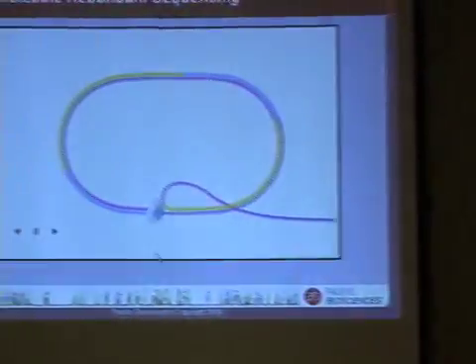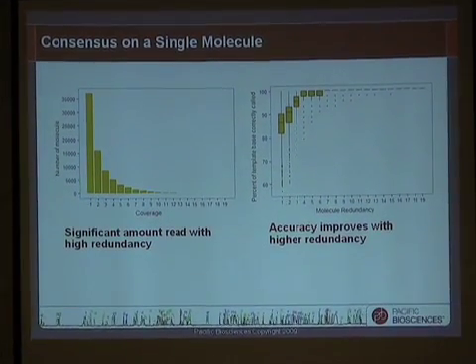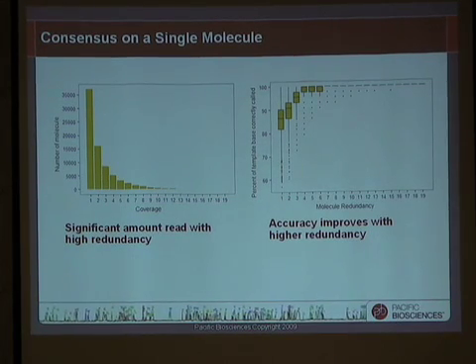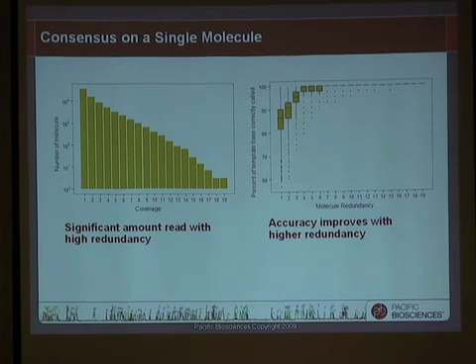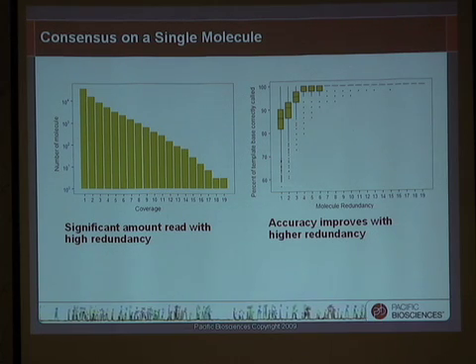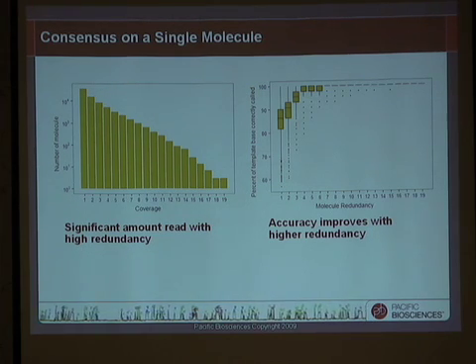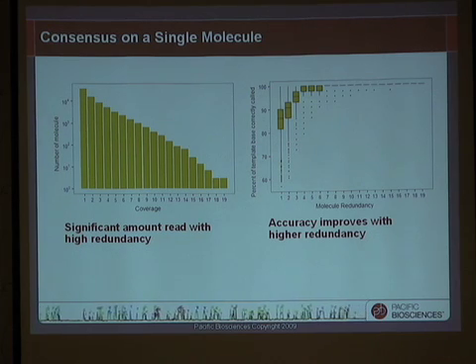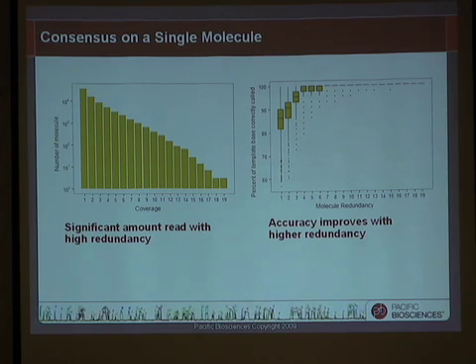One of the things you can do other than scaffolding, as was alluded to earlier, with that extra read length, is that you can sequence around and around the same molecule and increase confidence in what that one molecule sequence is. This is that same read length distribution now converted from length into fold coverage on a short molecule. And I'll put those same data on a log scale so that I can point out that in some instances we got as many as 19-fold coverage on just one molecule. And the approach towards consensus within a molecule is actually better than between molecules. But the important thing about this is that by the time you've reached consensus, this information is completely free of ambiguity that would be caused by heterogeneity in the sample. So be it polyploidy or heterogeneity or a pooled sample, in this instance you know that the consensus is looking at just one base.